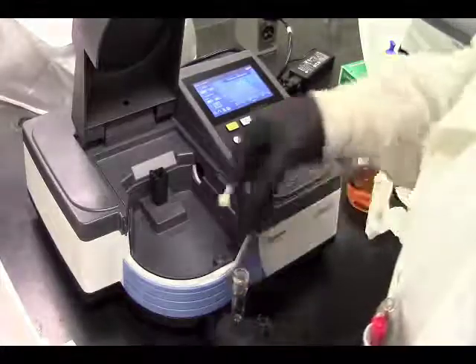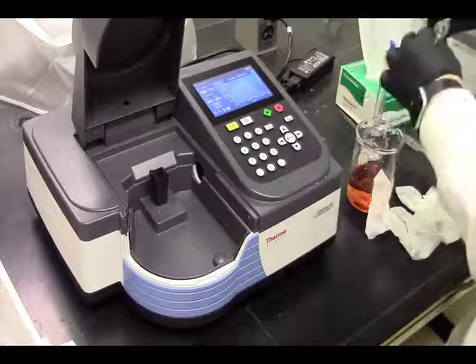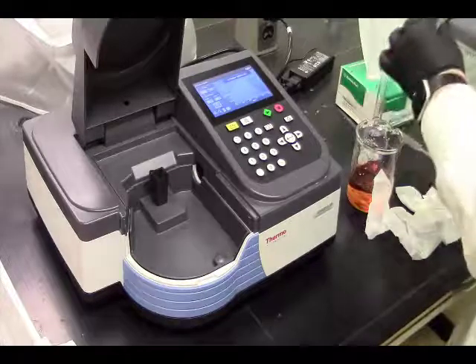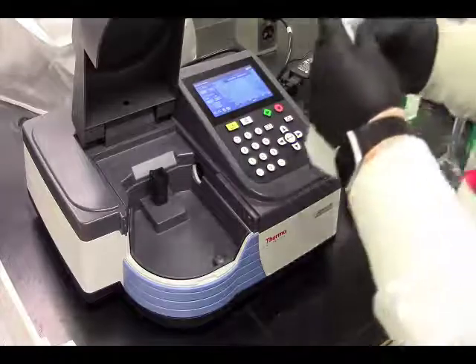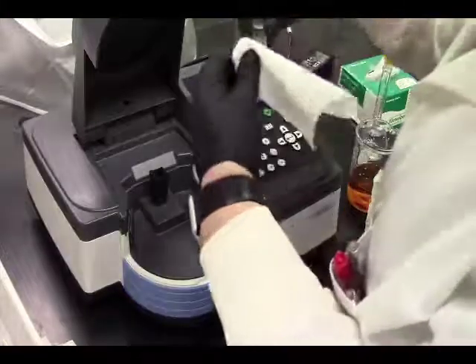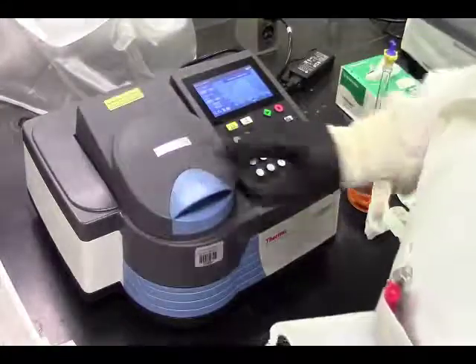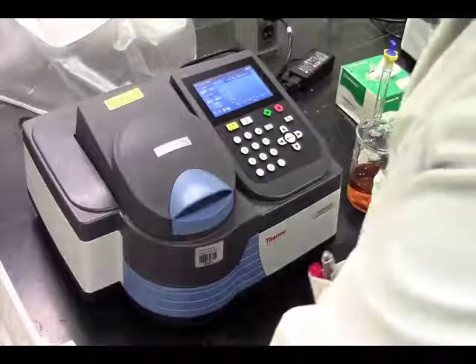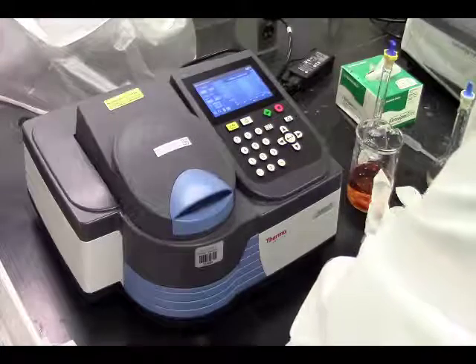We will have to do several rinses with this one now because we have gone out of our sequence. Trying to put the stopper on the cuvette. Not a good move, huh? Does not fit. That's like a round something in a square something. Doesn't fit very well. You know, kind of like doing online analytical labs. We're doing what we can for you.